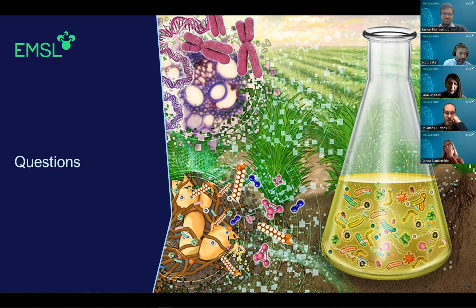And then for fluorescent cell sorting, we have single cell fluorescent cell sorting, so you can use fluorescent cell sorting and cellenONE to dispense your wells into the chips. Now, if you have that also, we can also send chips to you for that. So, yeah. Thanks. Very good.